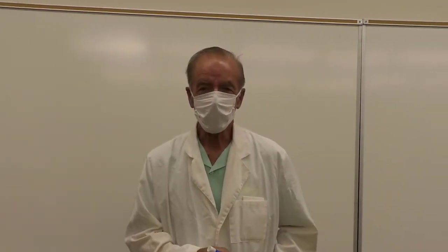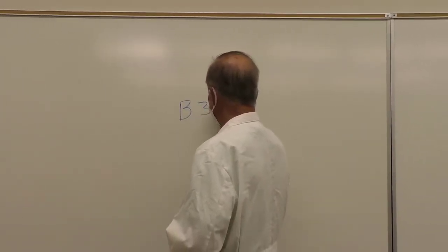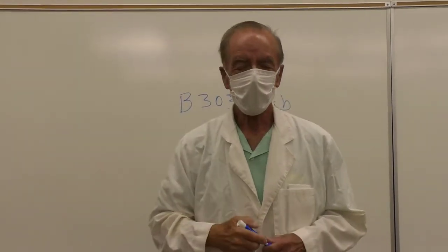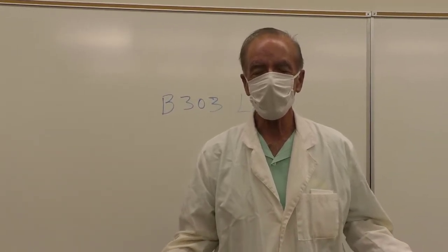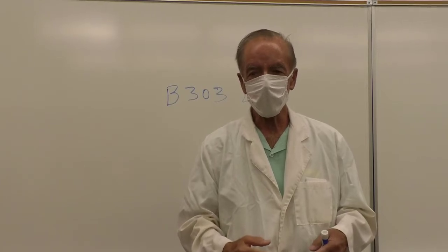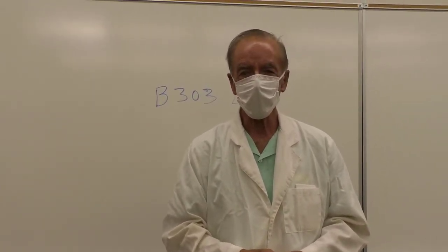Well, welcome to B303 Laboratory, B303 Lab. I'm Professor Reichert, and with me is Tim O'Donnell, and we're going to give you a brief orientation to the laboratory as if you were a student coming into the laboratory, and we'd like to introduce you to all the features of the laboratory.